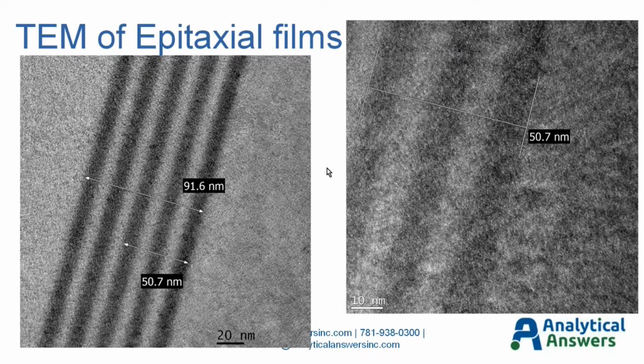And as an example of that, I've shown here a series of germanium and silicon lines that were grown epitaxially on single crystalline silicon. This is actually used as a magnification calibration standard for the TEM. The 5 dark lines you see here are germanium. Again, they're heavier, so they show with darker contrast than the surrounding silicon. And we can measure very precisely the various dimensions on these. These lines are on the order of 10 nanometers or so.